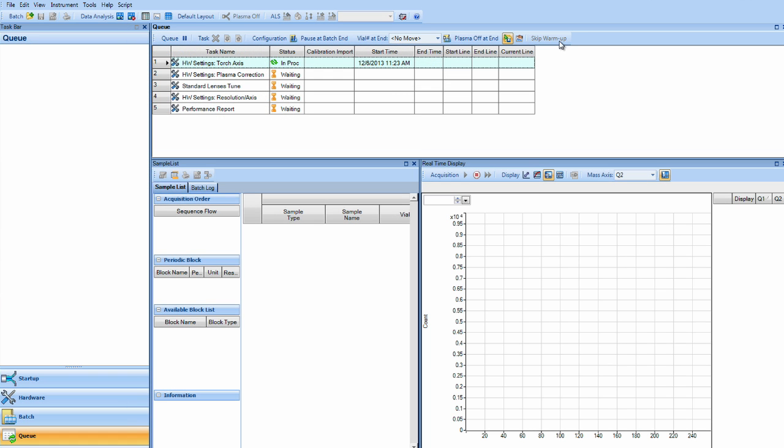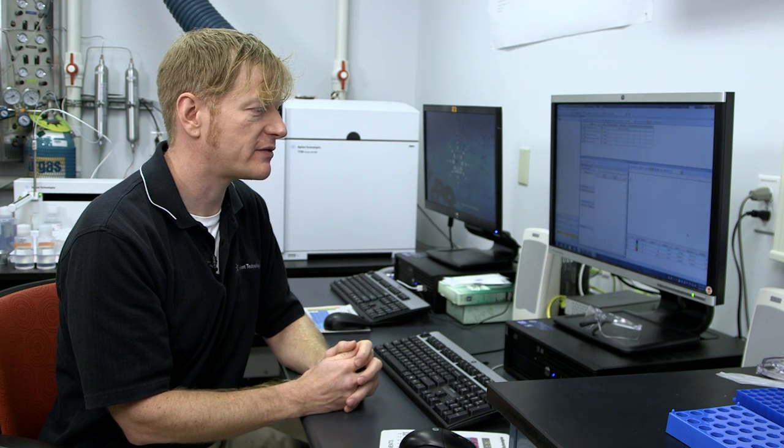The first option is the torch axis position, which is the horizontal and vertical torch positions. In the startup, we're analyzing mass 7, mass 89, and mass 205 for our best torch position and highest sensitivity.